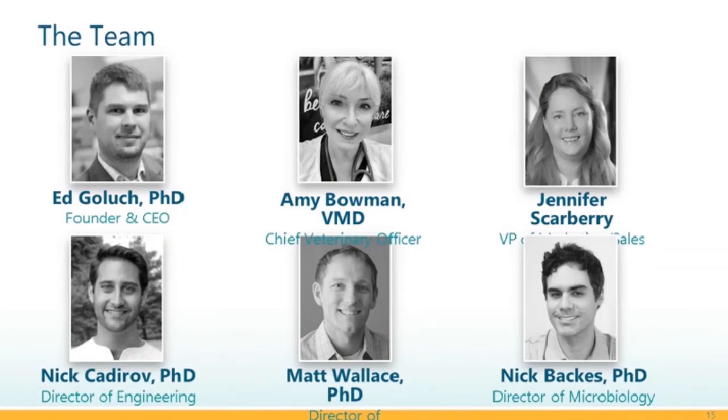My background is in chemical engineering as a person working in bioanalytical sensors. Some of the results I'll share today are also from my academic lab work that we have done to prove out this new platform. We have at QSM a strong group of individuals that have expertise in engineering as well as microbiology and biochemistry. Our first application is actually geared toward companion animals, so cats and dogs, looking at ear and urinary tract infections. But the platform that I'll be talking to you about can be utilized for a number of different applications.